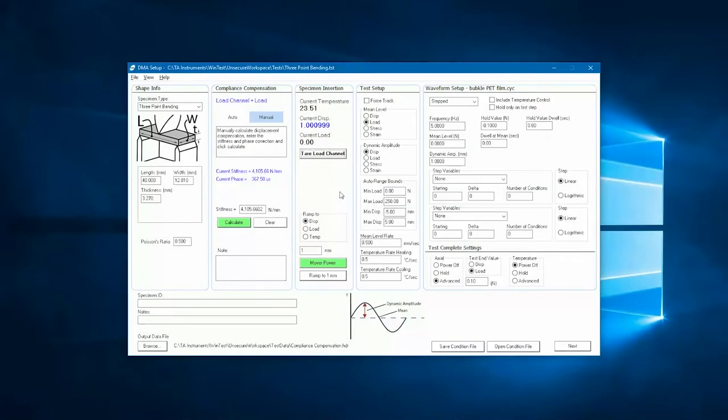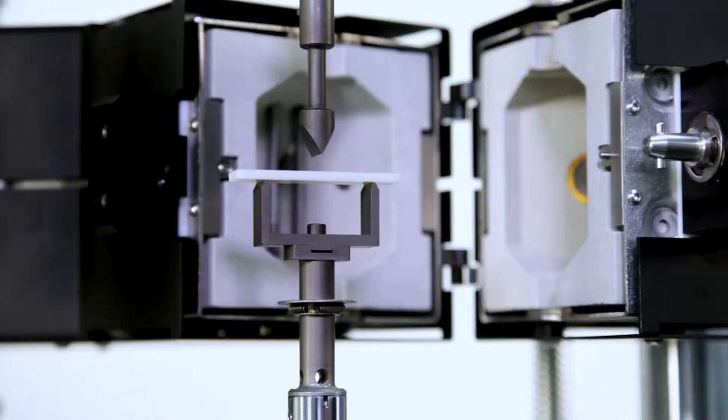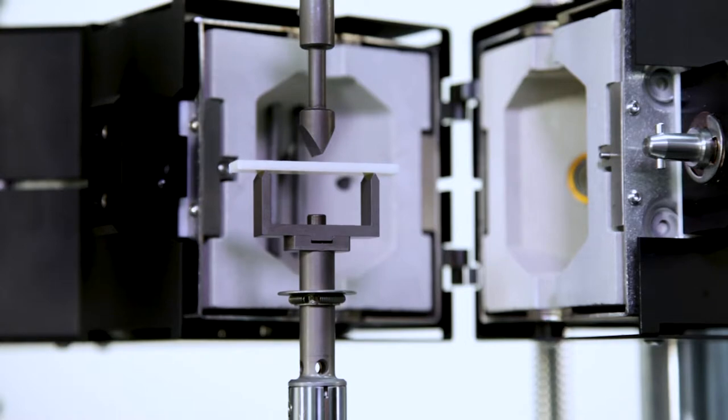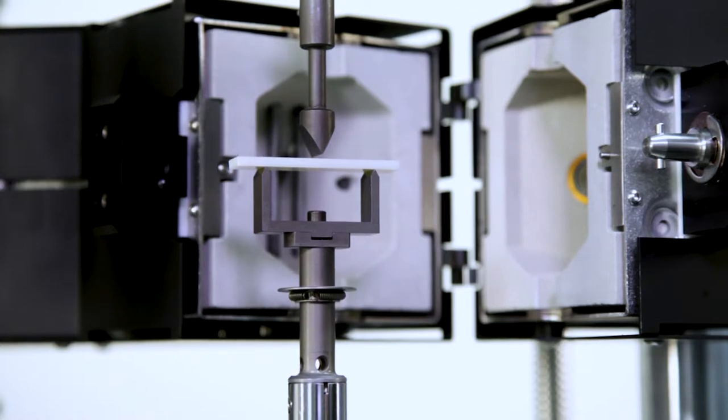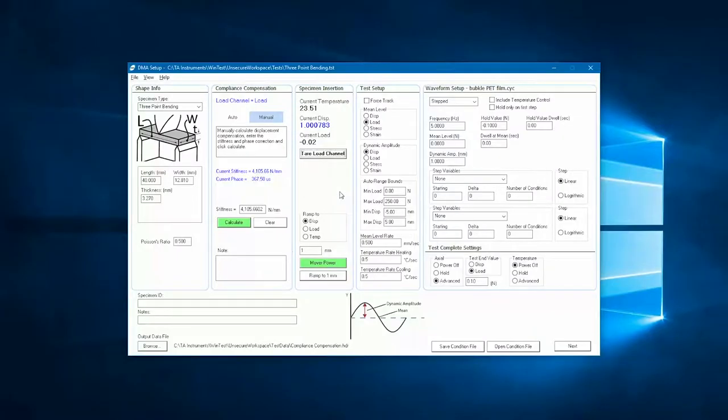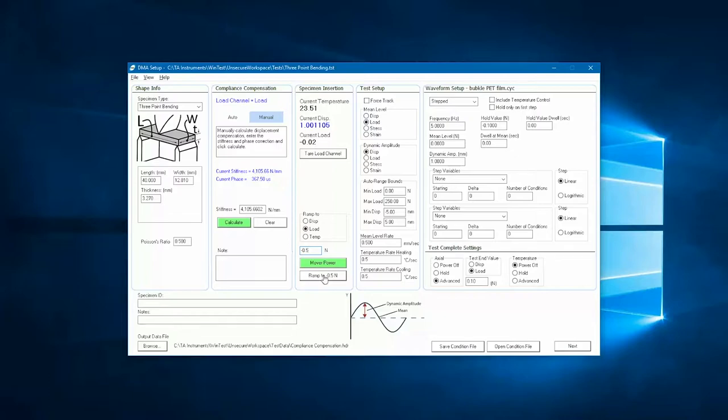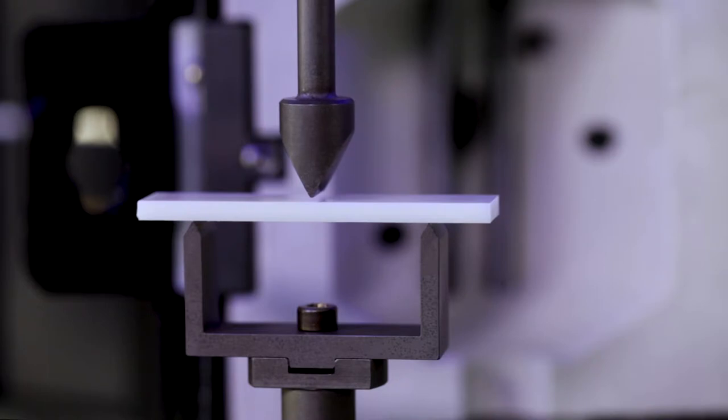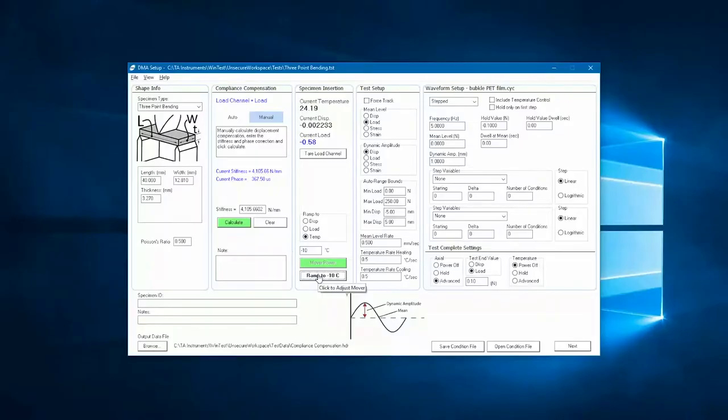Then using the electric lift, we bring the crosshead upwards until the sample is very close to the upper fixture. Using the radio buttons, I select load, type a desired preload value, and click on the ramp to button. This will engage the adaptive controller and the motor will apply the desired compressive load. Notice that the current load is displayed in blue font, which means that the adaptive controller is maintaining a commanded load value.